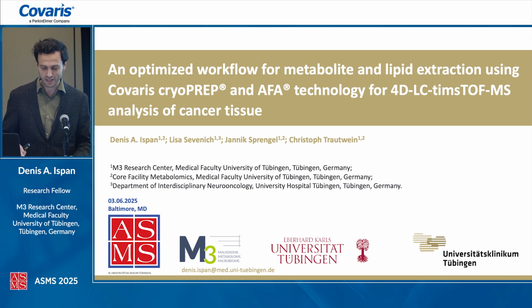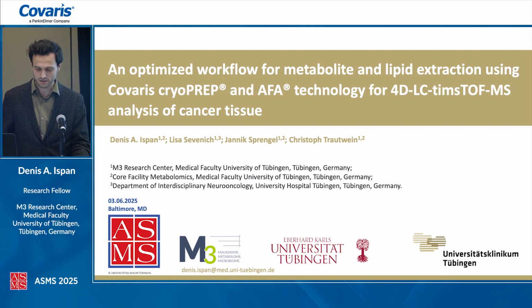And today I would like to walk you through how we use Covaris CryoPREP and also the AFA technology for our metabolite and lipid extraction, as an example for the analysis of cancer tissue.